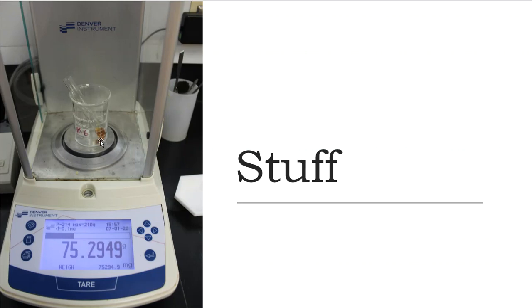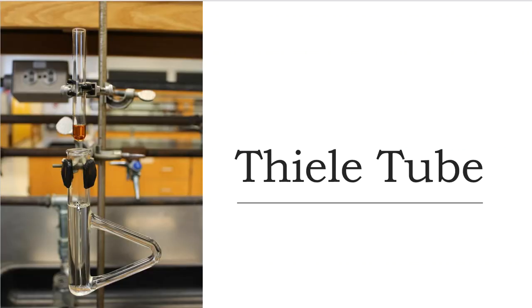All right, so we need a boiling point out of this, right? How do we get a boiling point? Well, we're going to use something called a Thiele tube in our laboratory. A Thiele tube is basically this tube over here to the left with this elbow that you're seeing, and it's filled with mineral oil. Mineral oil can hold pretty hot temperatures for what we need in the lab, so it makes a better choice than water, which can only go up to 100. And we know that these alcohols have a boiling point higher than 100, so water was not going to work for me. Here in the test tube at the very top, what you're seeing is my hexanol, and we need to get a boiling point of this.